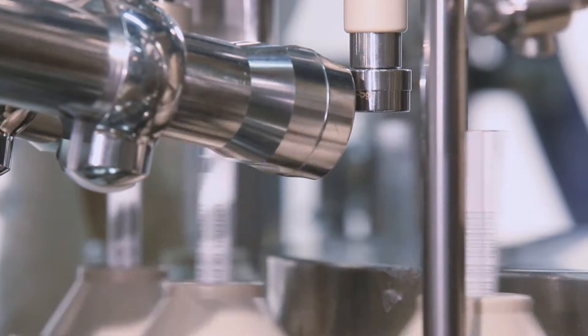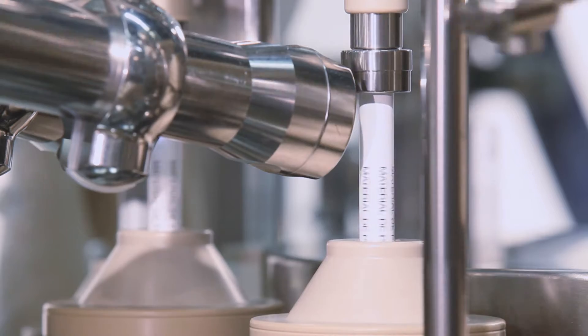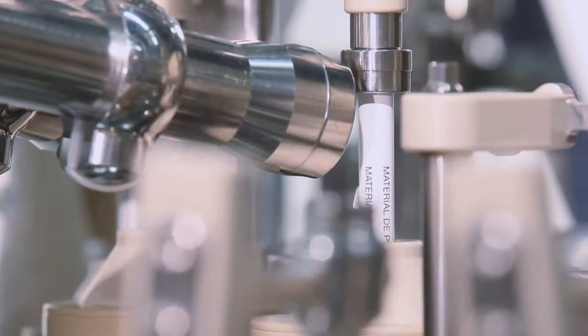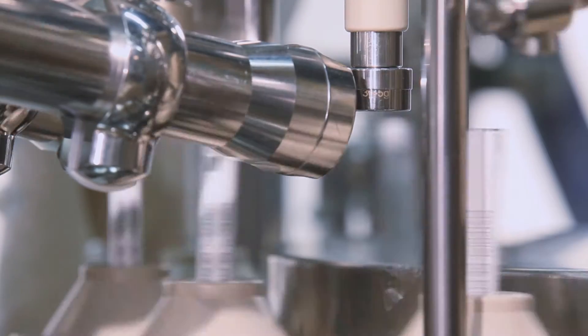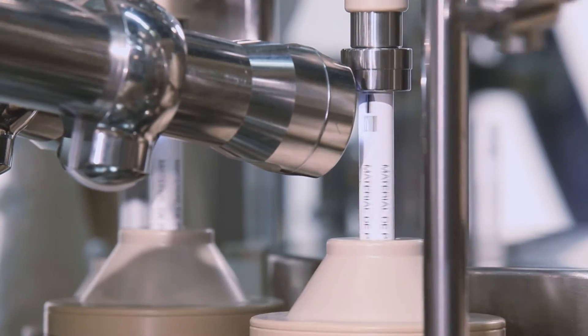The tube print registration mark and lot number code are inspected by a barcode scanner while the tubes are oriented to ensure the correct print position in relation to the seal. The barcode scanner is, as all sensors in the machine, embedded in a special stainless steel housing which allows easy cleaning.